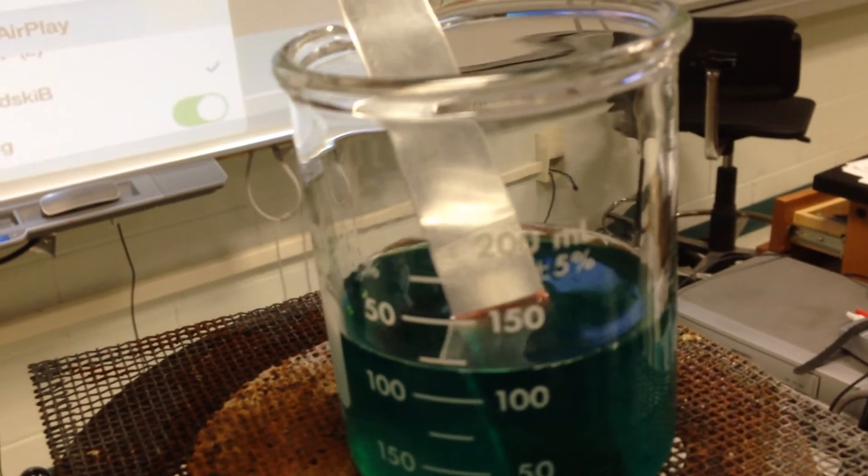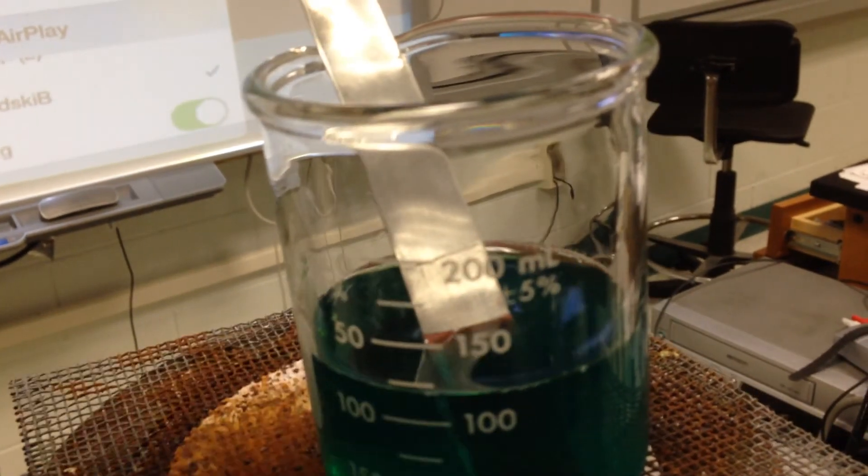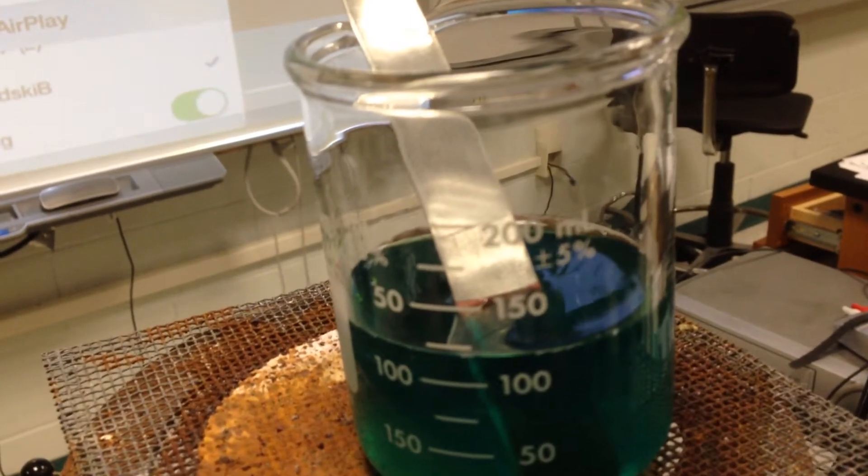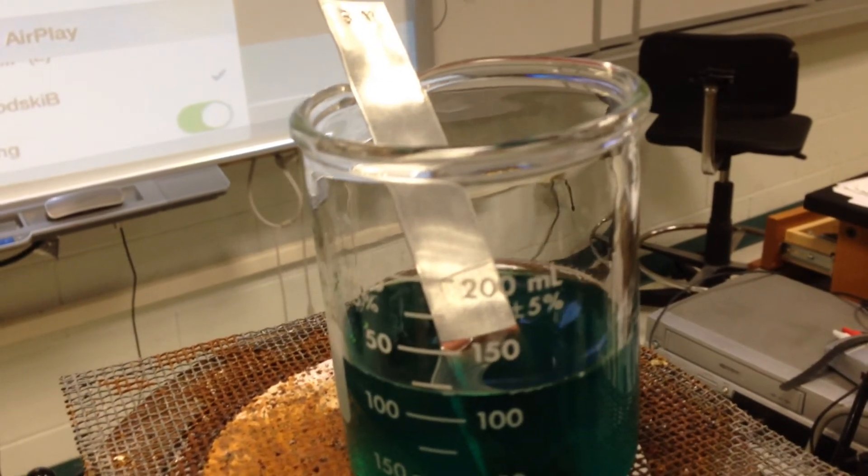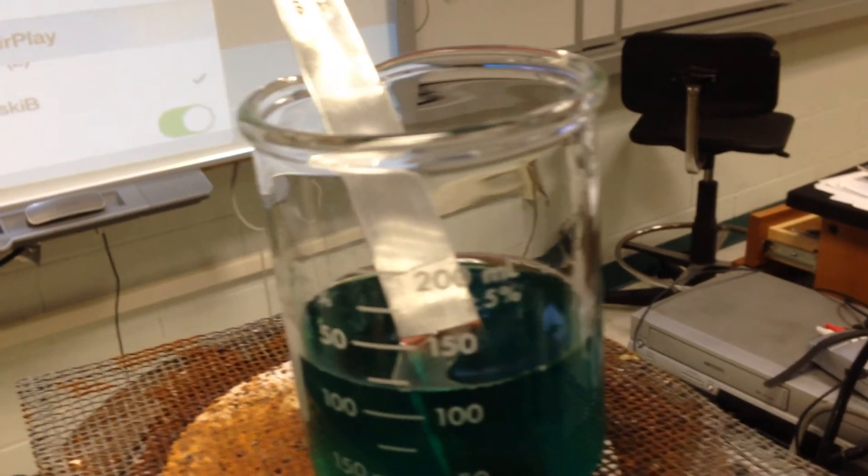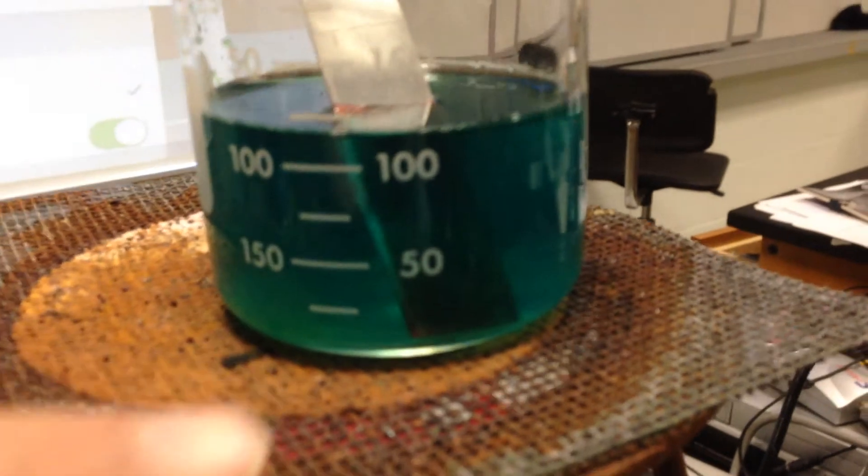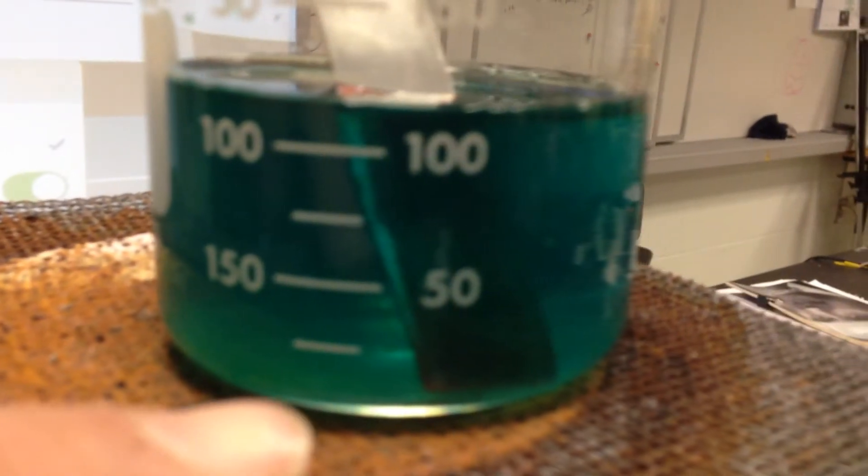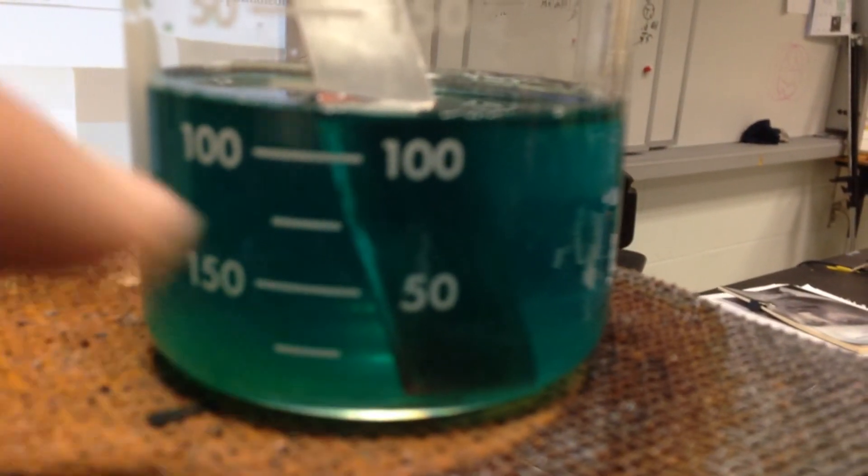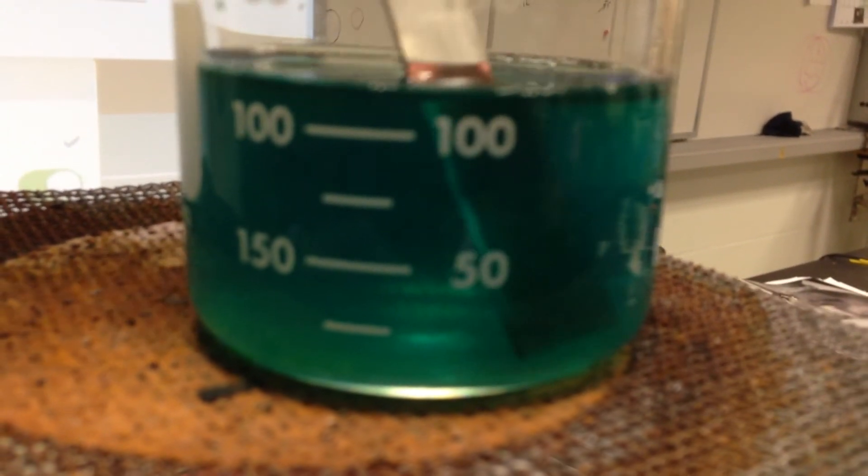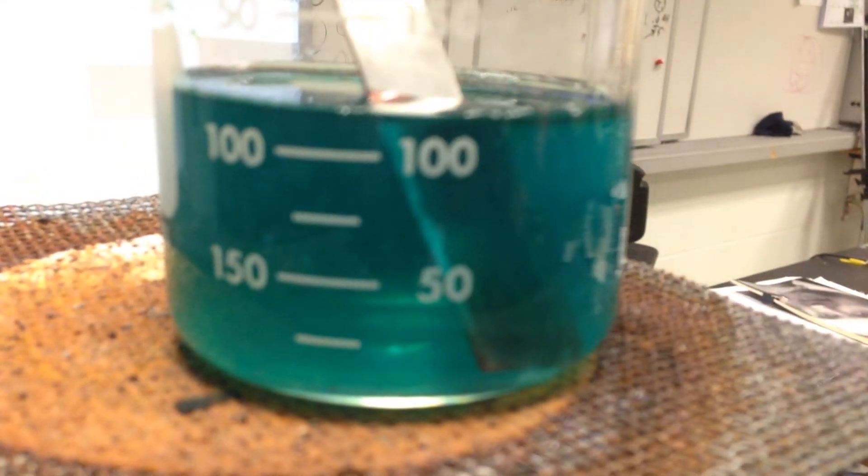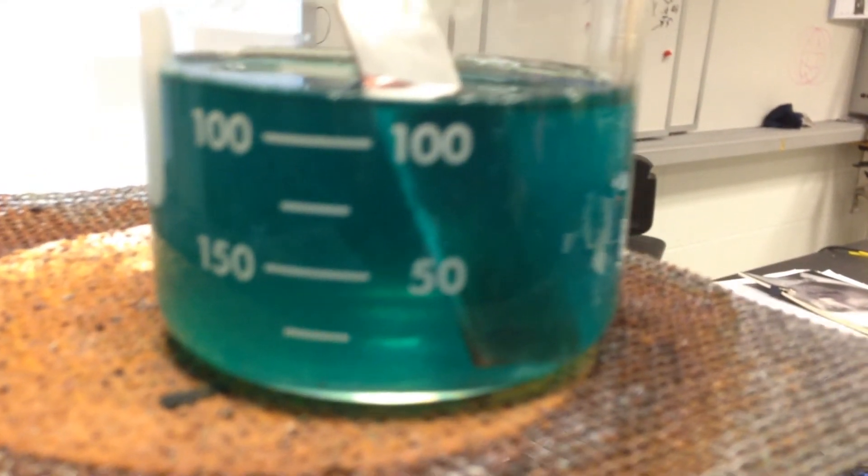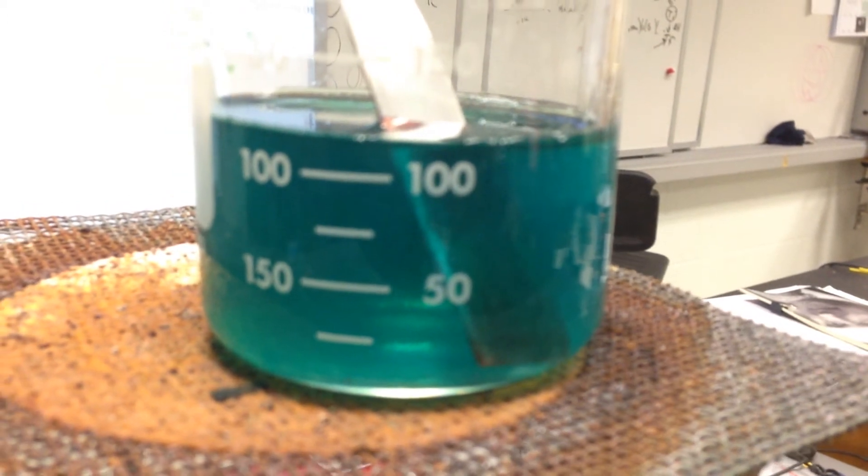The tin is forcing its electrons on the copper plus two, acting as a reducing agent. The copper plus two is acting as an oxidizing agent. You can see from this angle where that white substance is starting to appear, and that is just the tin plus two being developed there.